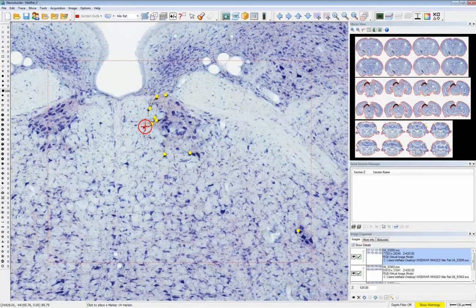So Sue, I'm not a scientist. How long do you think it would have taken to do this all by hand? Well, even with our auto move box, which allows you to trace and automatically move the image or stage as you are working, that increases throughput a fair amount. But I would say that to do these 8 sections, it would take at least a number of hours. Wow. And we did it in just a few seconds.